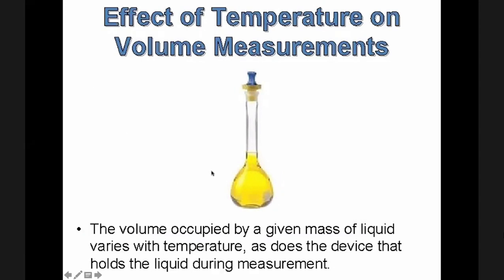And of course, during calibration of every volumetric glassware, you must also take note of the temperature and humidity inside the lab.